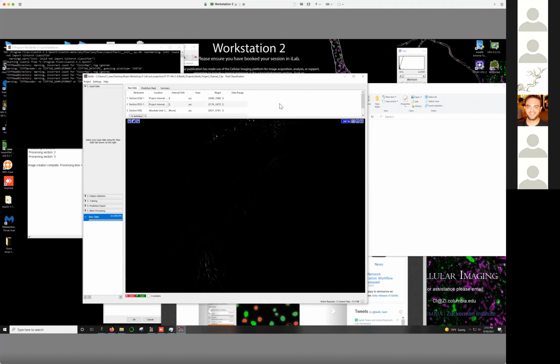This will clear these images out of the project, but leave all the settings intact. And then when you add new data in, like this one here, you can see it's just linked. It's not actually copied into the project. And this is actually a big problem. If you forget to copy the file into the project, you store this project, you delete the image or move the image, this project then actually becomes difficult to open and use. Especially if you spend some time training, you want to be able to keep that work.